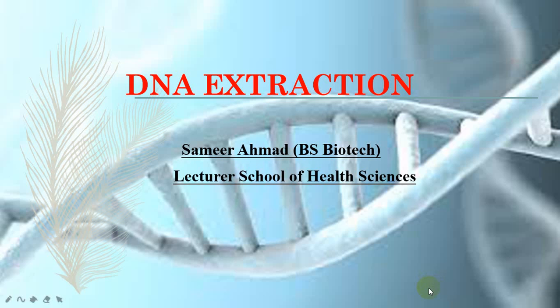Bismillahirrahmanirrahim. So our today's lecture is about DNA extraction. How can we extract DNA for any type of molecular activities? We need to extract the DNA from, for example, the cell of an animal, a bacteria or a plant, so we need a proper procedure for that. So here we will discuss only the basic concept about the extraction of DNA from any cell.